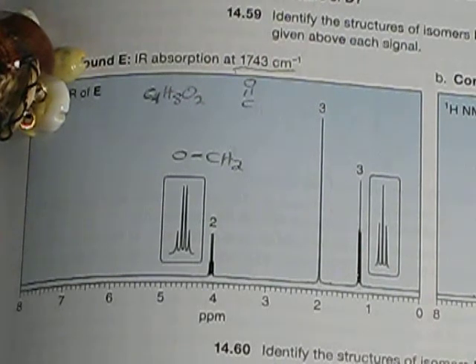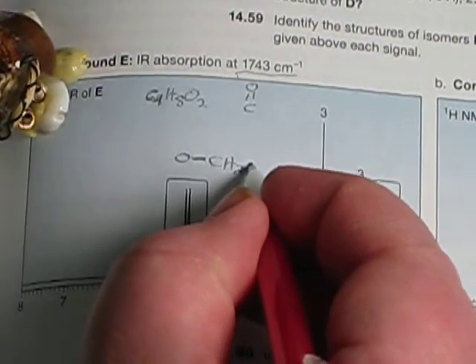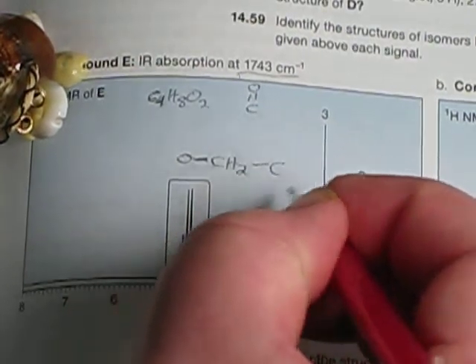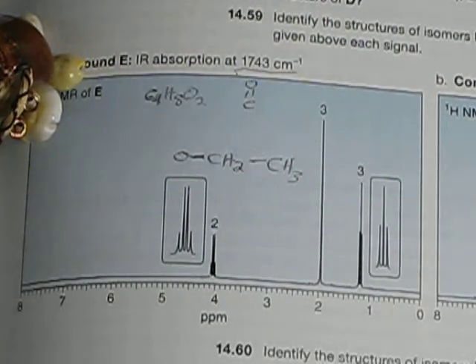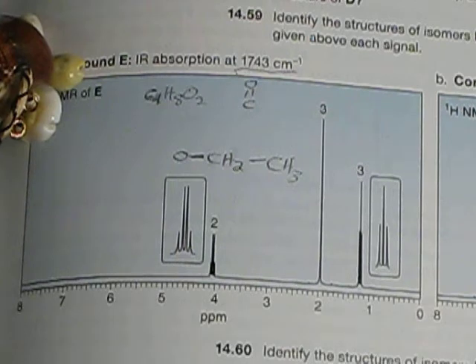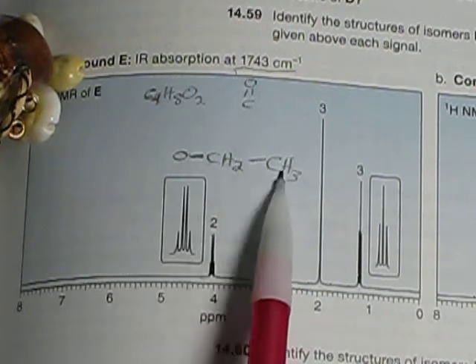And now you're saying, well, wait a minute here, Watson. Couldn't you have a CH2 on one carbon and then a CH on the next carbon? Well, that would give you 3 next door. But note, this carbon already has 1 bond to oxygen, 2 bonds to hydrogen. It can only have 1 more bond. So there can only be 1 carbon next door to it, and that carbon must contain all 3 hydrogens in order for this to make any sense. So we've got OCH2CH3. Now check this out. With this one peak, the first peak we looked at, we've already got OCH2CH3.